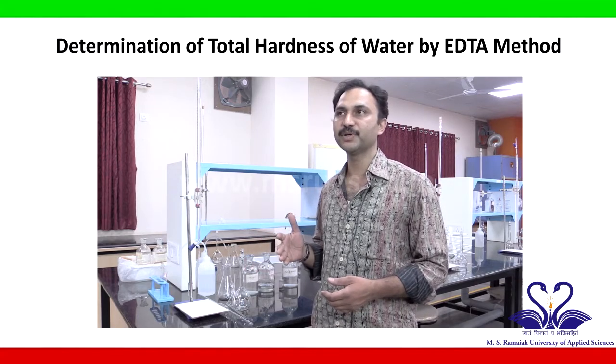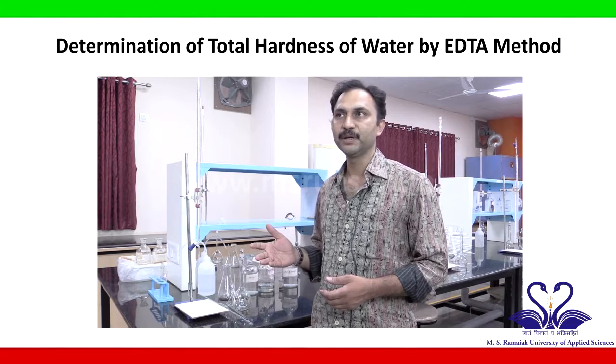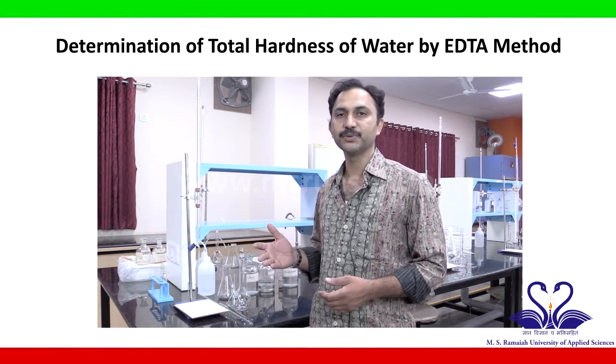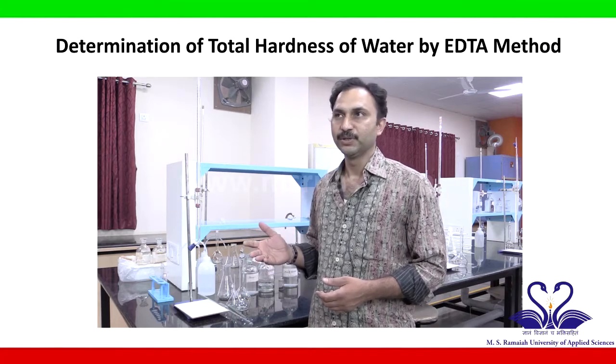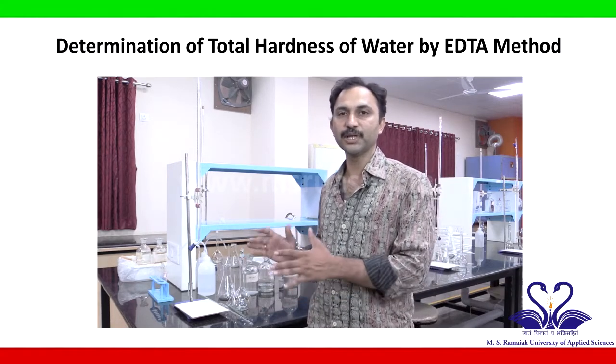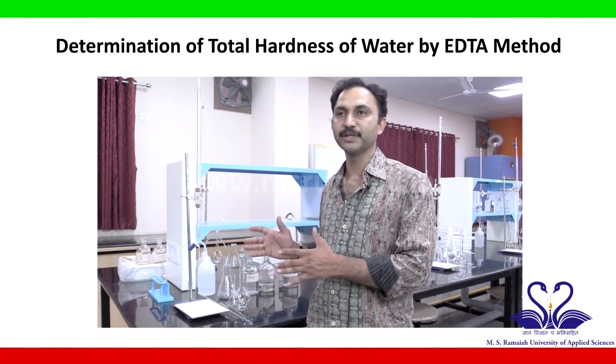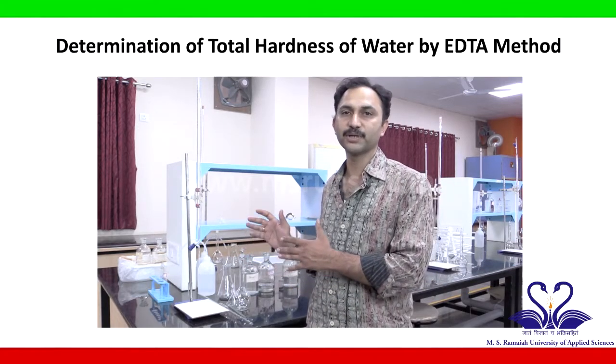Temporary hardness is because of bicarbonate salts of calcium and magnesium. Permanent hardness is due to calcium and magnesium salts of chlorides and sulfates. So in today's experiment, we are going to find out total hardness. We are not going to differentiate whether it is temporary or permanent. We are going to determine the total hardness of the given water sample.